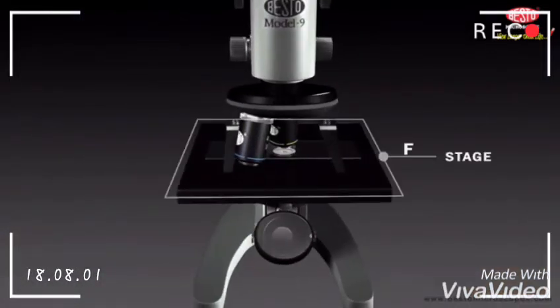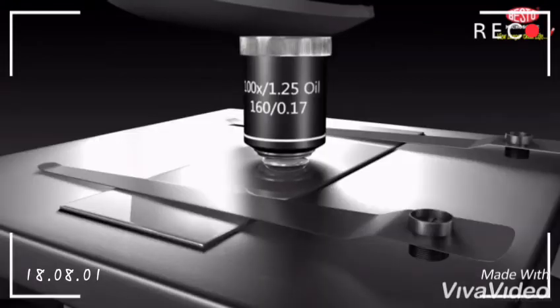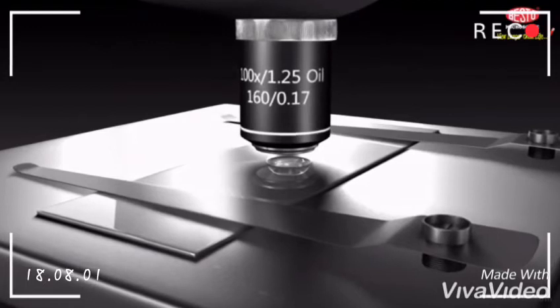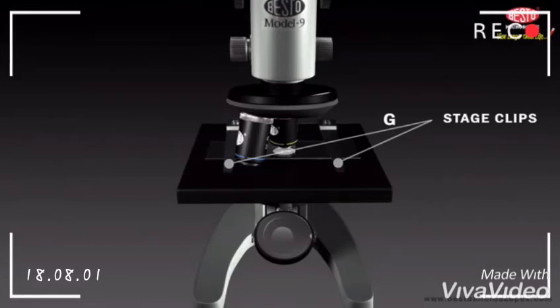The stage is the flat surface on which you put your slides or samples. The stage clips hold the slides in place on the stage.